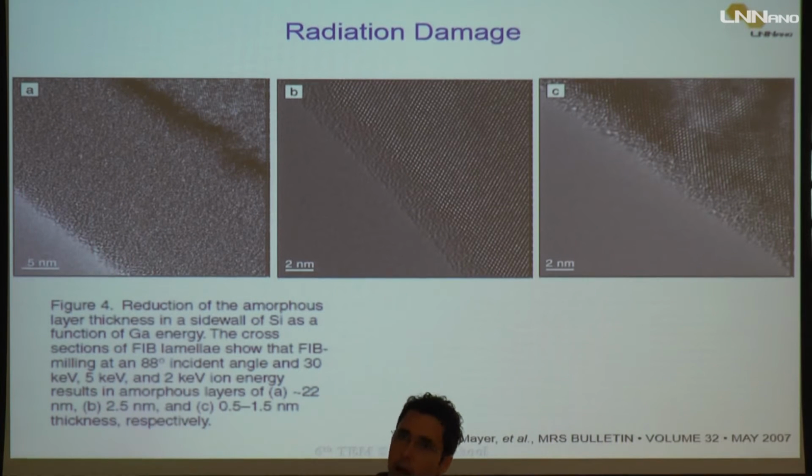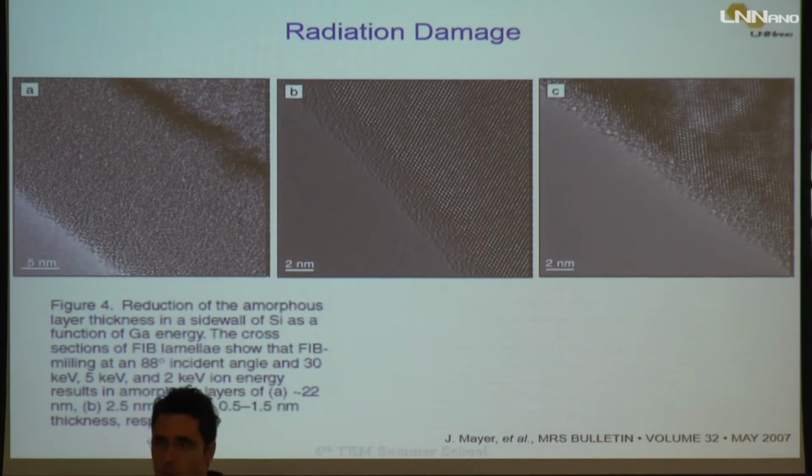This is the idea. All these steps that we use to prepare the sample will damage the sample in some way. And then the final steps need to be very, very mild. They may not be too harsh to the sample. You understand this? Okay.